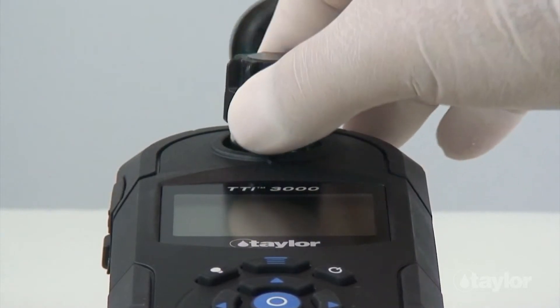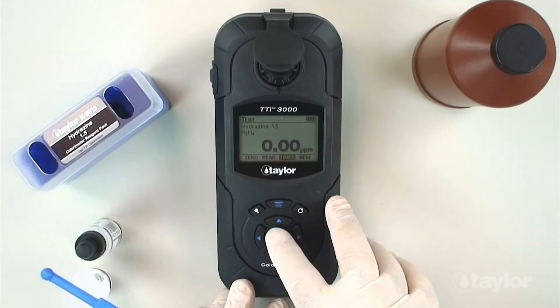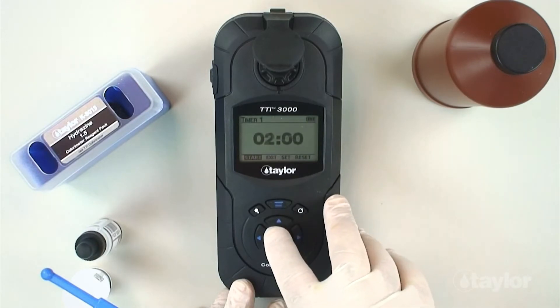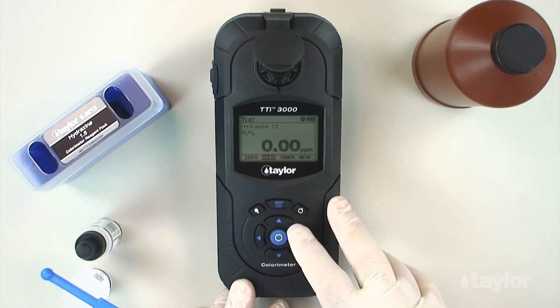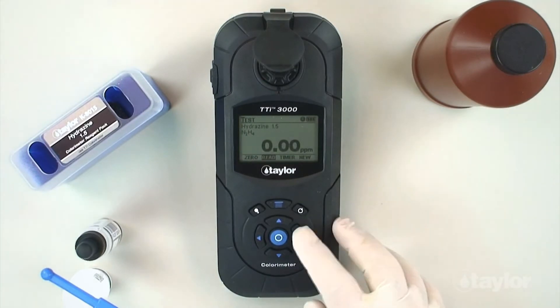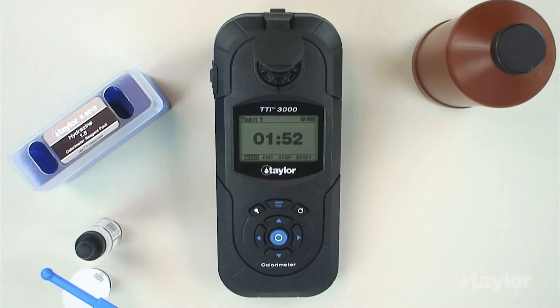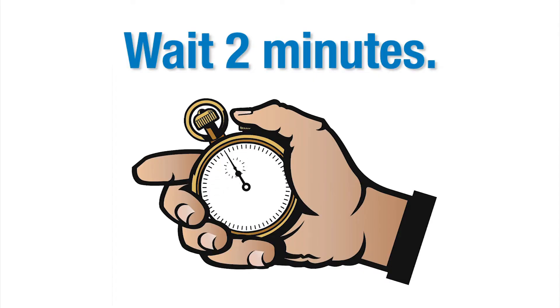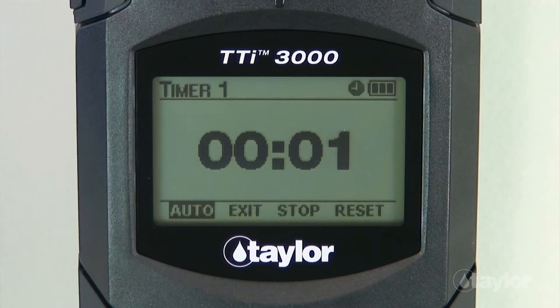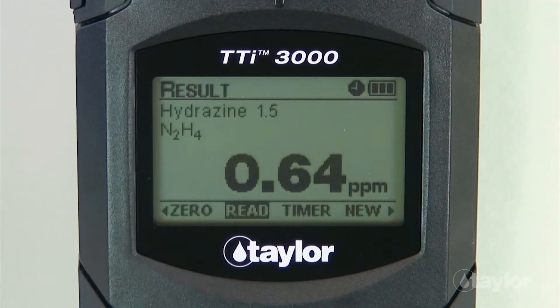Insert the sample cell into the sample cell compartment. Select Timer using the scroll arrows and press Enter. Select Start, then press Enter. A two-minute countdown will begin. Immediately select Auto, then press Enter. When the timer beeps, the instrument will read the sample and the result will be displayed.